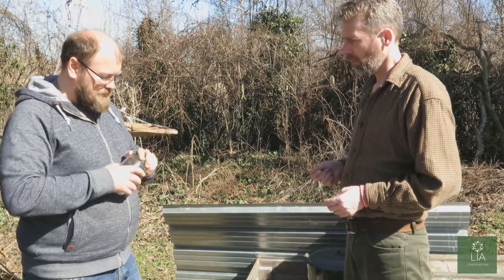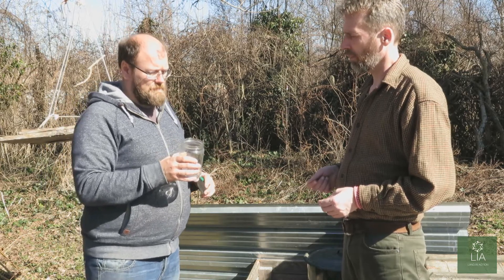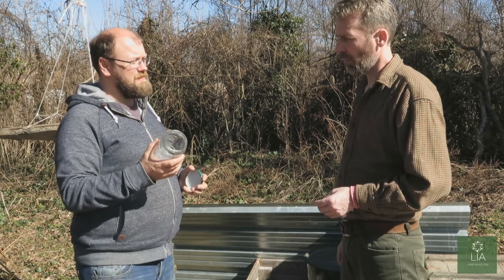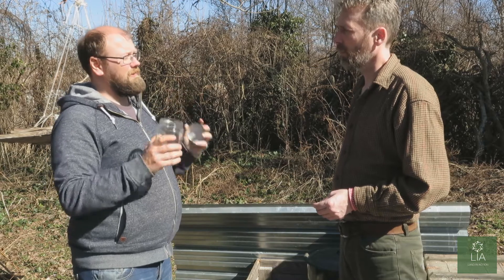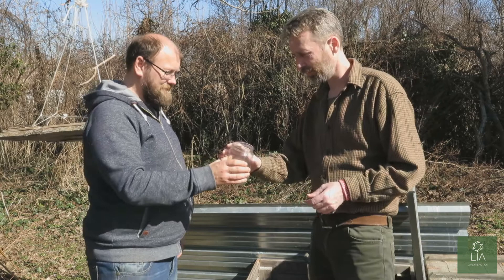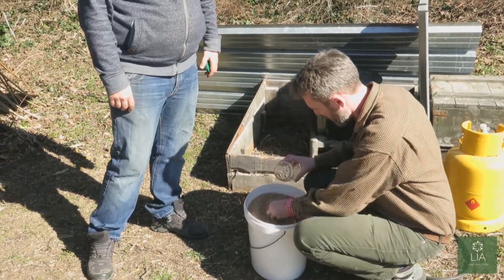You want about half of whatever size jar you're going to be using. We've got a relatively small pressure cooker, so the size of your pressure cooker will determine how many jars you can fit. This needs to cook about 45 minutes at pressure — first it has to get to pressure, then cook for 45 minutes. We're going to fill the jar approximately half full, put it into the pot, and take out any bits of straw if there are any.